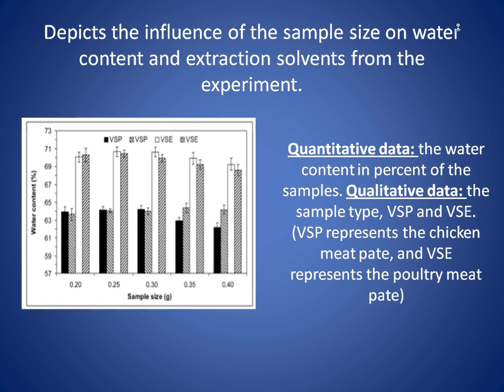The figure depicts the influence of the sample size on water content and the extraction solvents. When the sample size becomes greater than 0.3 grams, the water content will decrease, and vice versa.